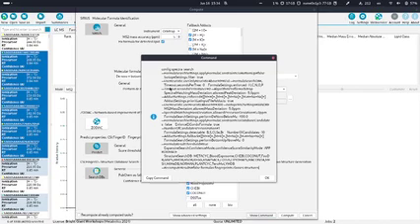Yeah, and one thing where it might be useful is if you, for example, have enabled Zodiac and you see that your laptop is not enough to handle it, especially if you have an older laptop, but you have access to a compute cluster. It can be a good idea to first import all your data and look at everything in the graphical user interface, then make the settings you want, and then just copy this command and of course your data and run it on a compute cluster, for example.